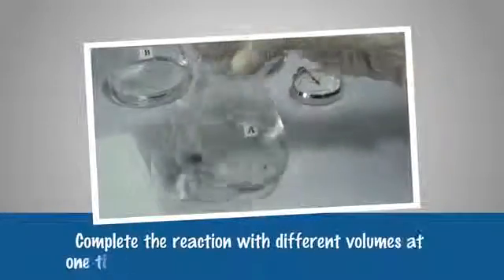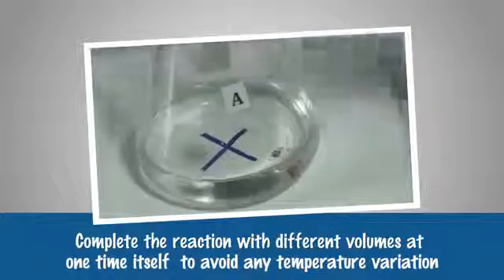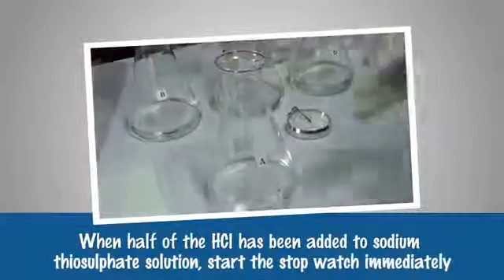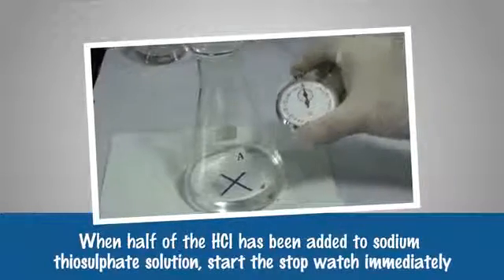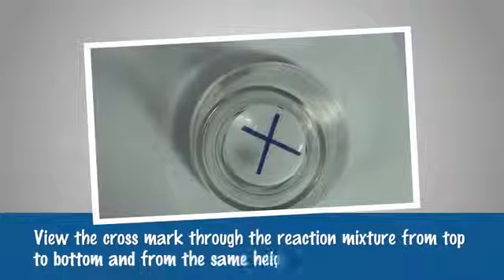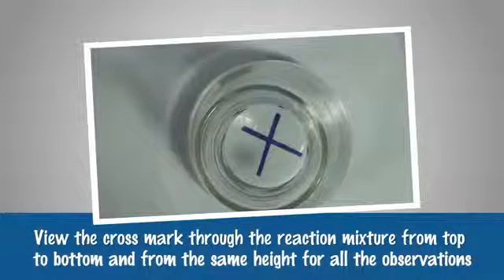Complete the reaction with different volumes at one time itself to avoid any temperature variation. When half of the HCl has been added to sodium thiosulphate solution, start the stopwatch immediately. View the cross mark through the reaction mixture from top to bottom and from the same height for all observations.